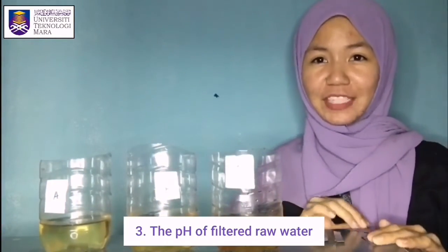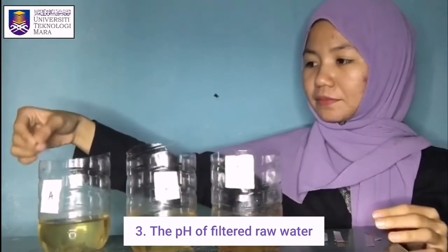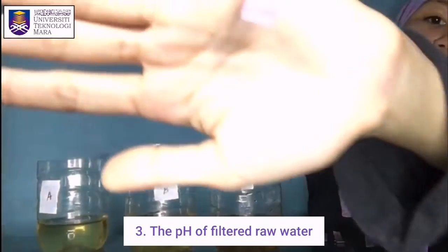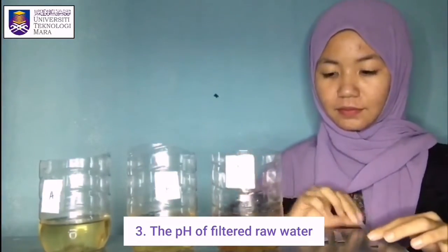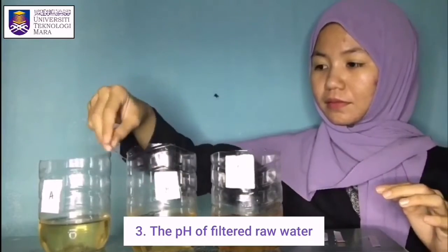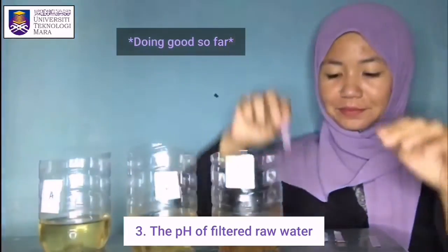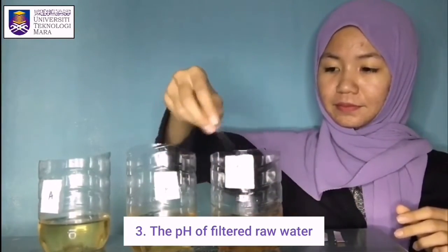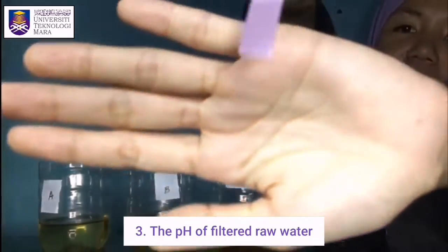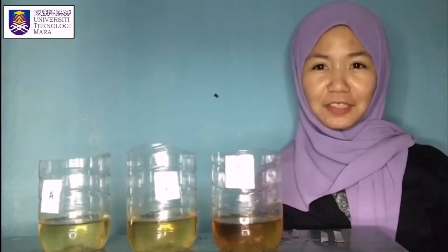Let's check the pH of the sample. Sample A has no change. Sample B has no change. Sample C has no change. Let's discuss the parameters for this experiment.